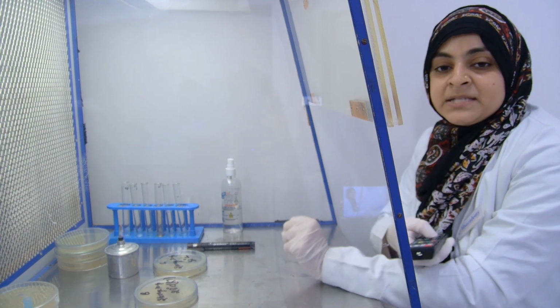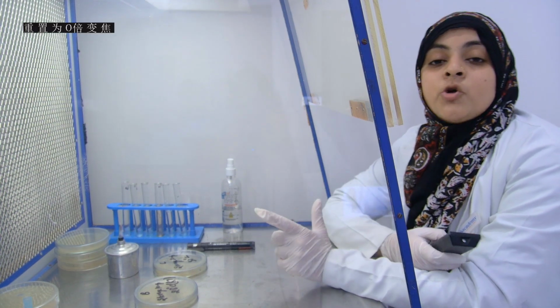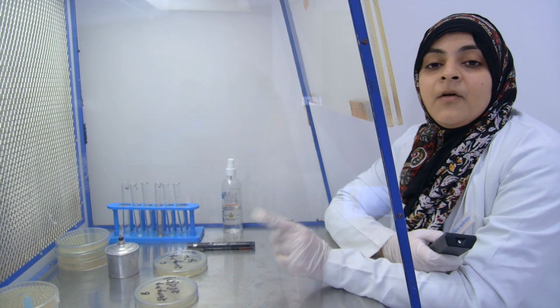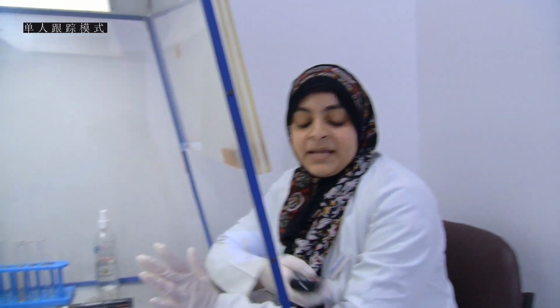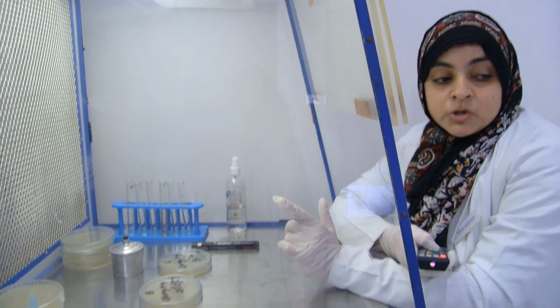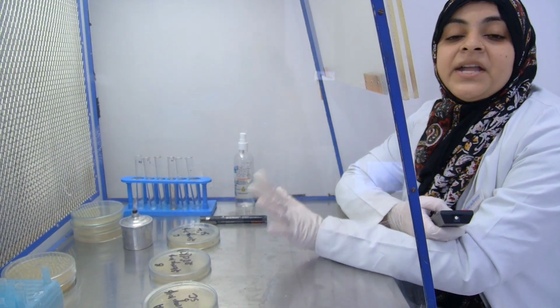After inoculation, we put that Petri plate according to the temperature. Like in the first Petri plate, we write down 5 degrees Celsius. So after inoculation, we put that Petri plate into 5 degrees Celsius for 48 hours. Now in the second tube, I write down room temperature, that is 28 degrees Celsius. So this plate should be kept at room temperature for 48 hours.